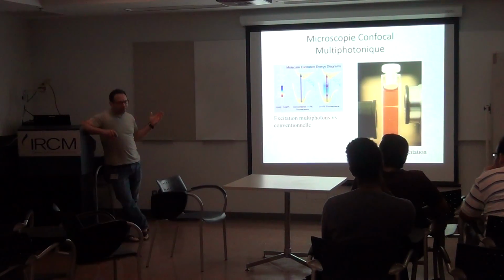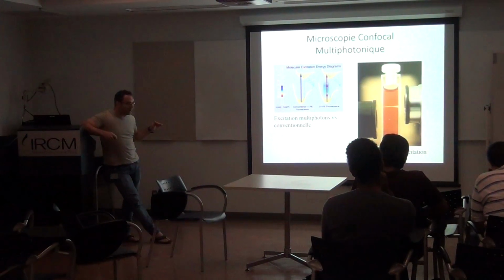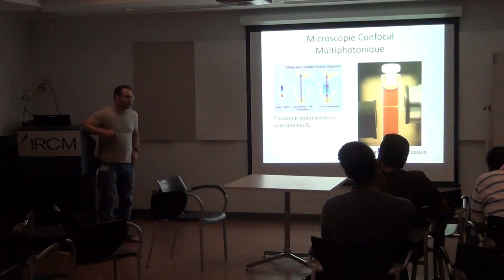And so here we don't have any pulsed laser in the institute, so we don't do any multi-photon microscopy. The laser by itself is worth a couple of $100,000. So it's about $250,000, I would say, just the laser source by itself. But it's a nice technique, and it is nice also because you shoot infrared onto your specimen, and infrared is not absorbed by a living specimen, except at the focus, where you get that probability to have 2 or 3 photon absorption.